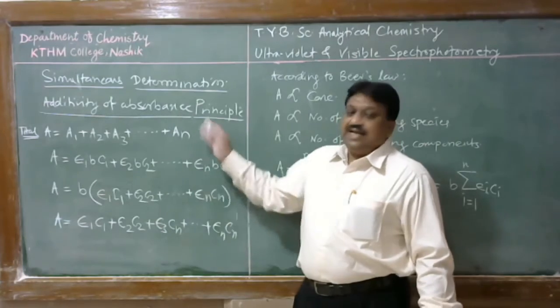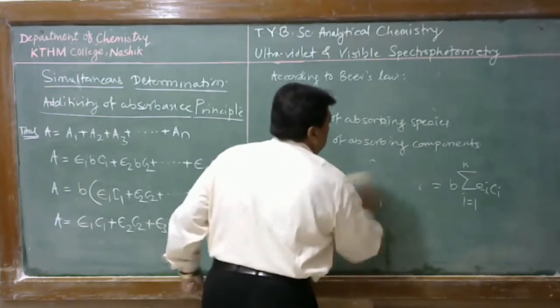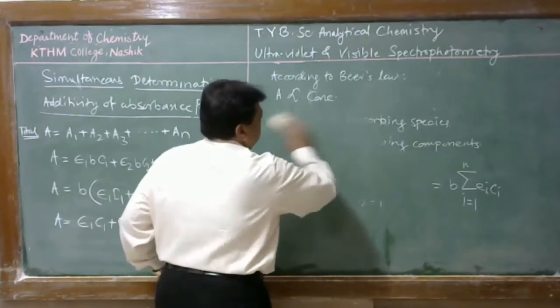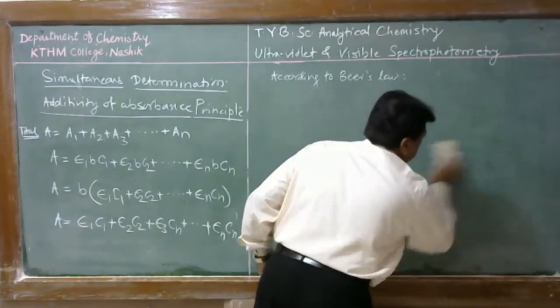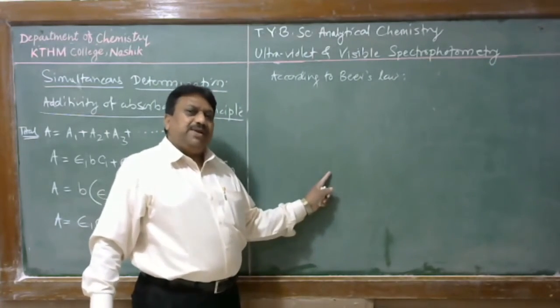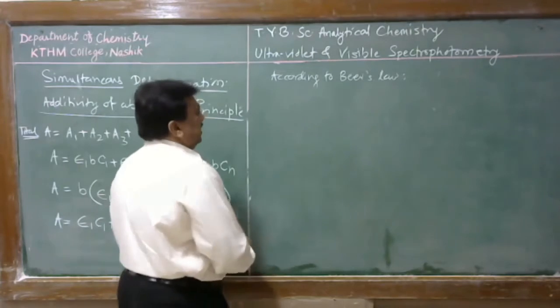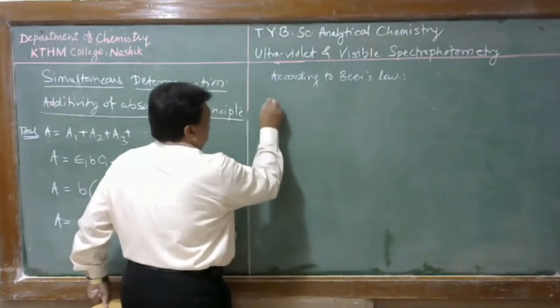In this way, we can apply this additivity principle for measurement of absorbance of two or more components, and if these components do not react with each other and have well separated lambda max values, then we can easily determine their concentration by means of Beer's law.